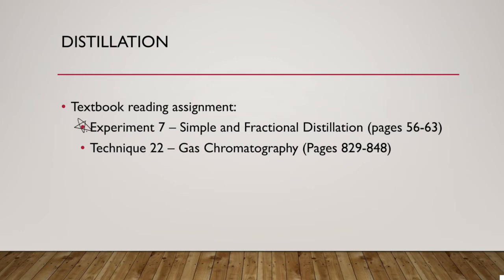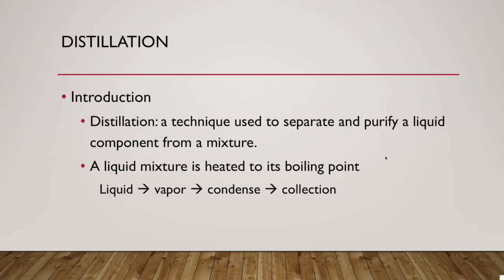One is experiment 7, page 56 to 63, and then technique 22, which describes gas chromatography, pages 829 to 848. Now, after reading those textbook assignments, I'm going to briefly explain today's experiment, which is distillation first.